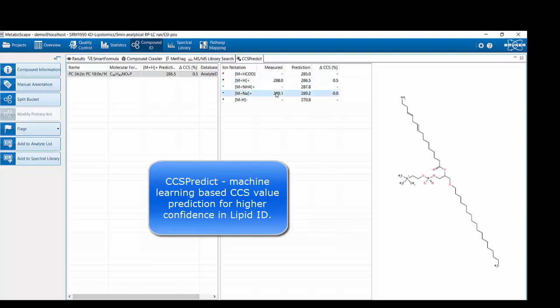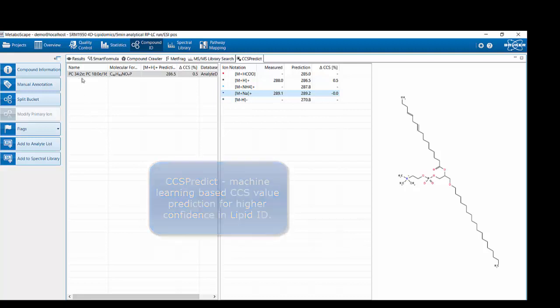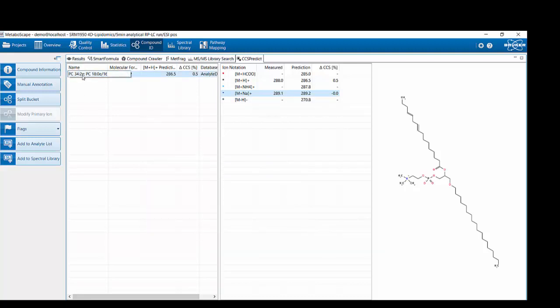T-Rex also extracted the sodium adduct and calculated its CCS value. Doing the prediction versus measured for the sodium adduct gives basically zero percent deviation. This further increases the confidence that we are looking at a lipid class of PC 34:2E.